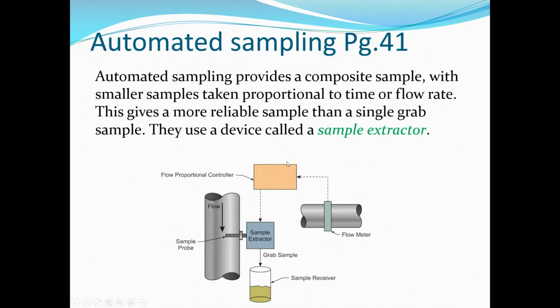Okay, automated sampling we'll hit on really quickly here. When I worked at the wastewater treatment plant here in Red Deer a number of years ago, they had several areas where they did this automated sampling.